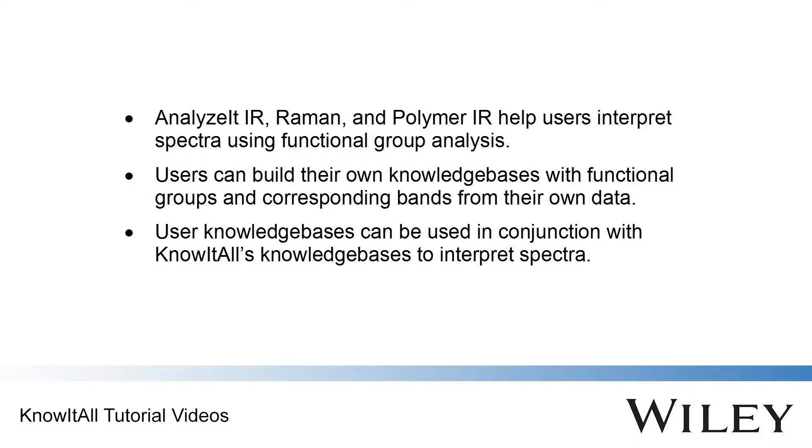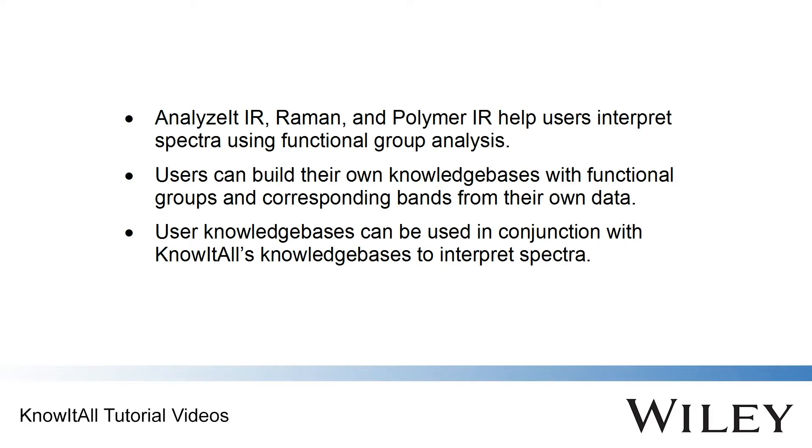Analyze-It IR, Raman, and Polymer IR are Know-It-All applications that help users to interpret spectra using functional group analysis. A new feature has been added to the Analyze-It applications so that users can now build their own knowledge bases with functional groups and corresponding bands from their own data. These knowledge bases can then be used in conjunction with Know-It-All's knowledge bases to determine the functional groups in a spectrum.